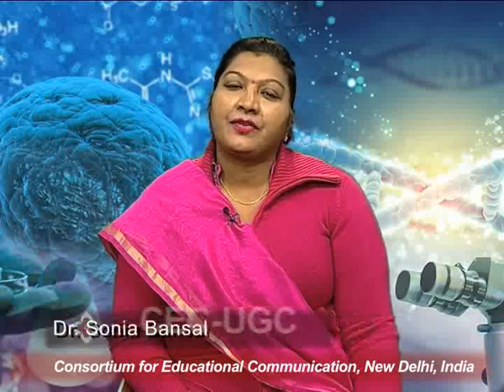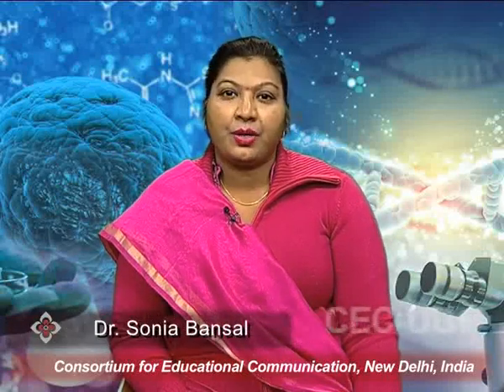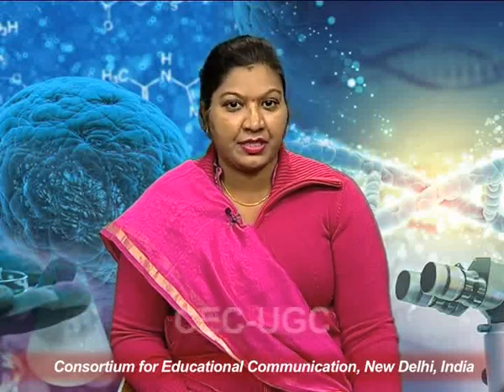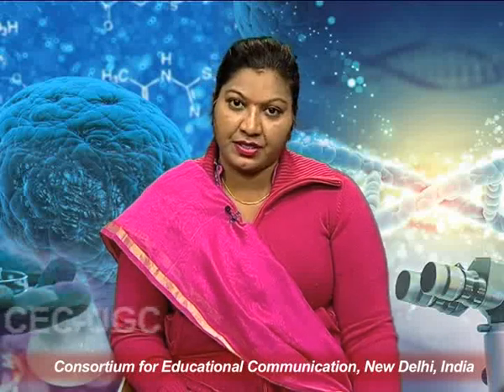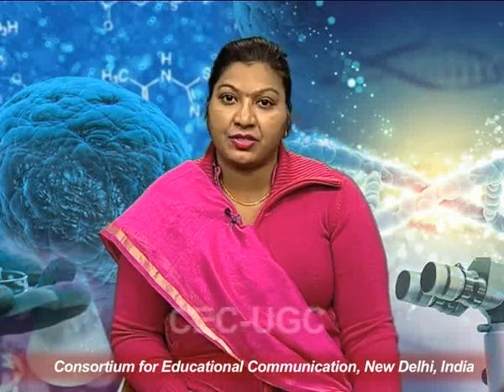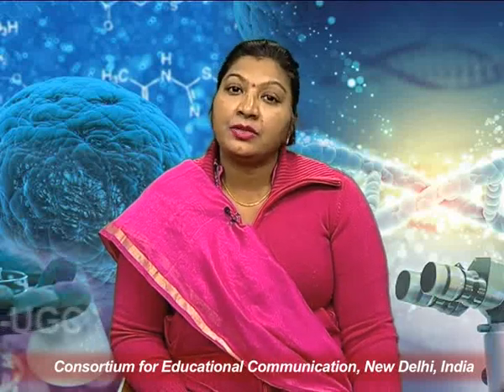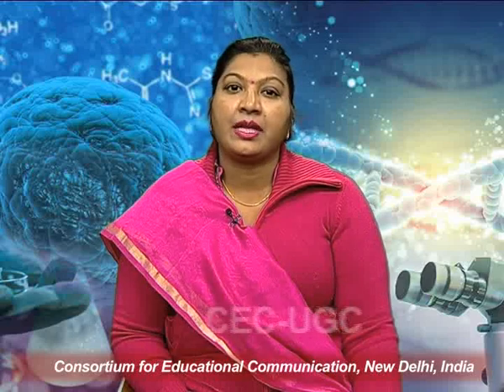We are in the series of characterization of nanomaterials, where we discuss the various methods of nanomaterial characterization. In the last two lectures we discussed the X-ray diffraction method. What is the X-ray diffraction method, and why are we studying it, we discussed in the previous lectures. After that we discussed the important components in X-ray diffraction, and in today's lecture we discuss the various methods of X-ray diffraction.